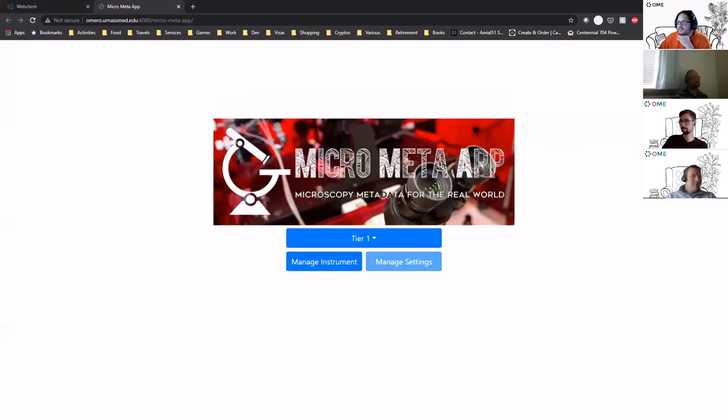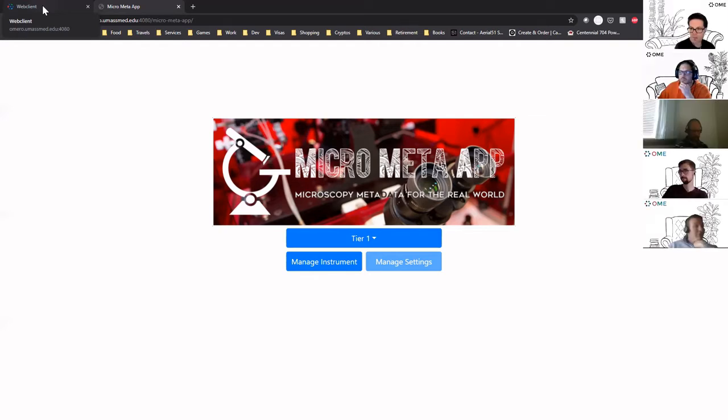So yeah, this is great to capture all this metadata, but in terms of the general workflow that people will do, at which stage do you think they would be doing that? Because obviously that's quite involved in terms of the amount of data you need to capture.